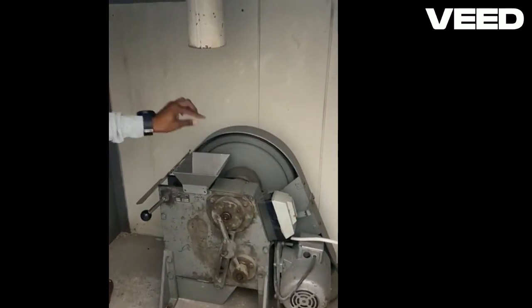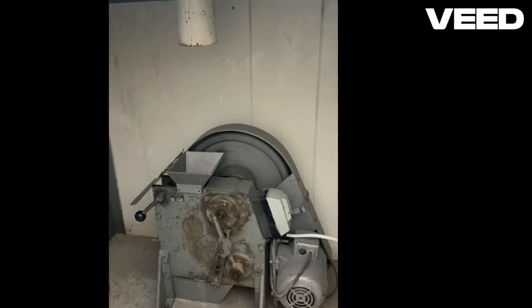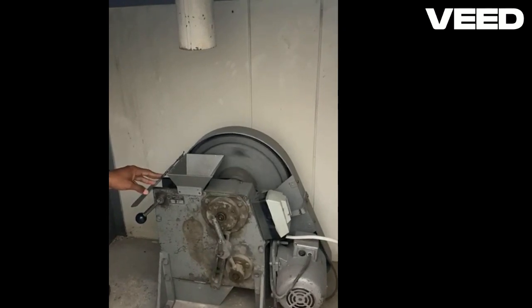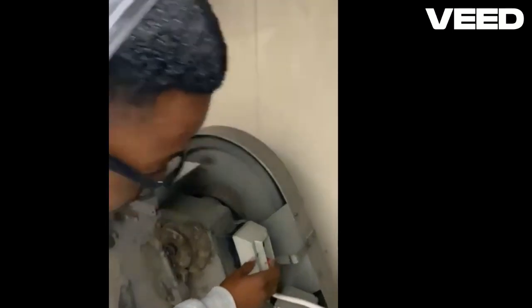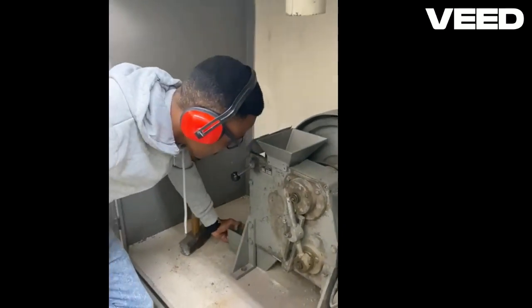As it turns, the material is fed into the crusher, where it is subjected to compressive forces that break it apart into smaller fragments. But after putting the sample in, the machine makes a loud sound due to compressive forces. When the crusher is done crushing, the machine goes back to a light sound. Then you can switch off the machine and collect your primarily crushed samples.